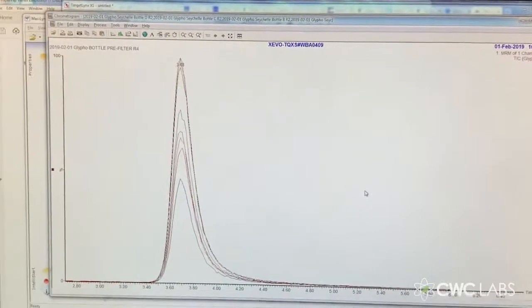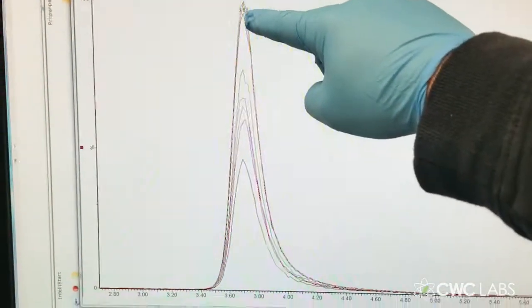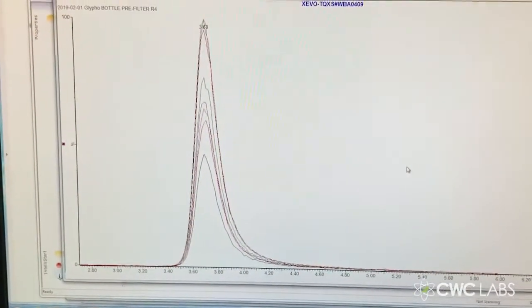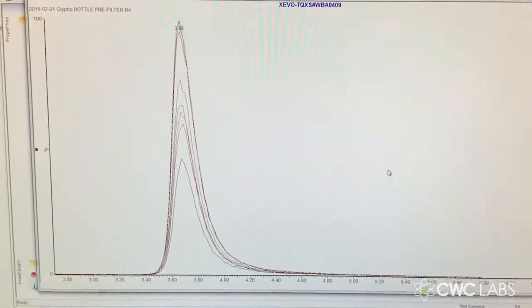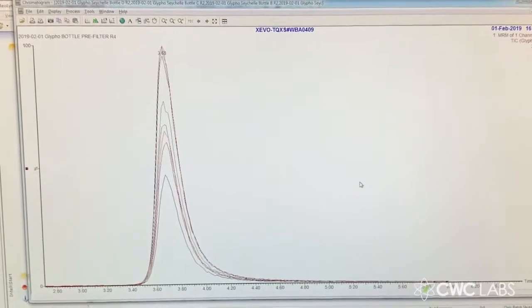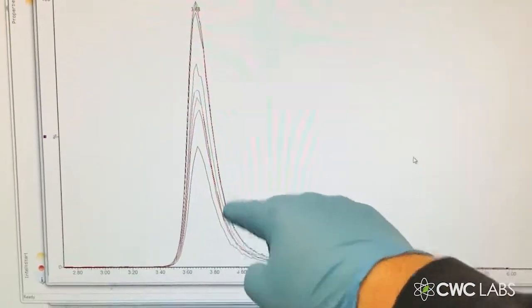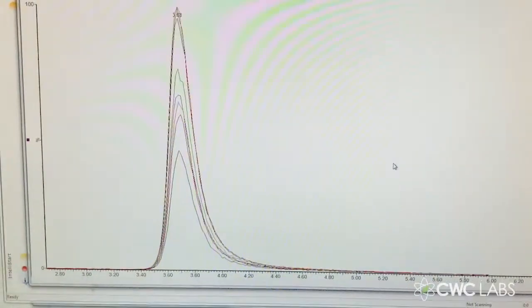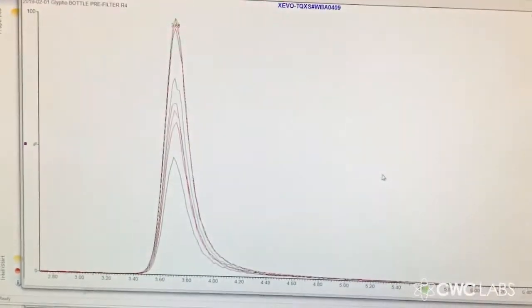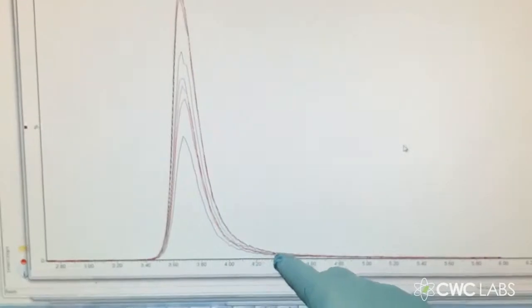All right, these are the bottle water filter test results. Now, this cluster that you see up here, those 3, those are all the non-filtered water. That's the 2 ppm glyphosate. I ran it 3 times just to make sure we're getting consistent results, and we are. But what's really interesting is these are the water bottles showing the resulting glyphosate concentrations at different levels below the original 2 ppm. Now, none of them are down here, which would be a really strong result.